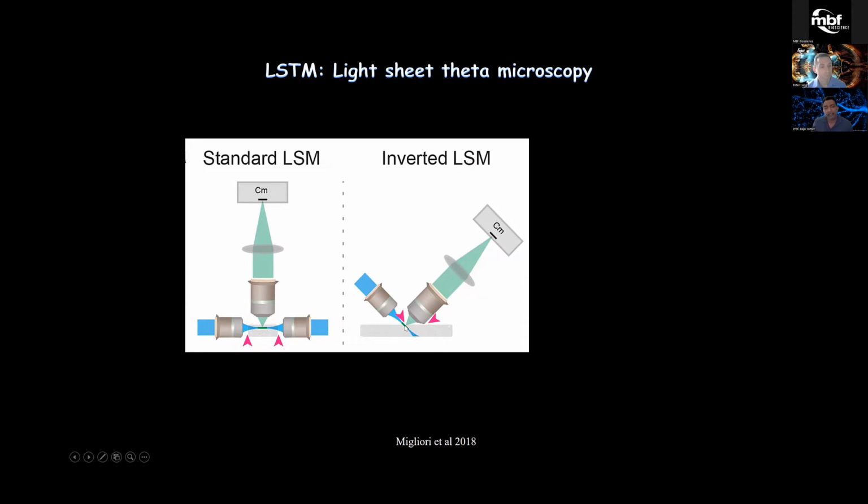And then the second issue, which I think is also significant, is that you are imaging an oblique plane. So a plane, different parts of which are exposed to different amounts of tissue, right? So if we are trying to image this plane, the signal coming from different parts will have to travel different amounts of tissue, right?